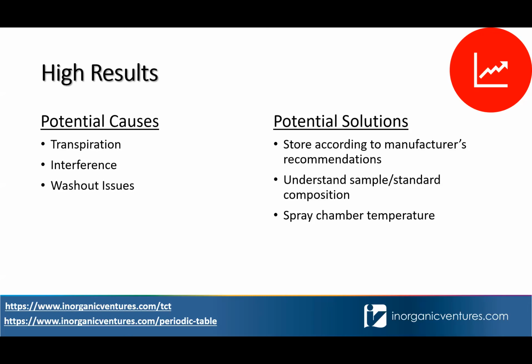For transpiration, we recommend storing according to the manufacturer's recommendations, or the recommendations you would typically see from a manufacturer. We know that refrigeration is not necessary, but there's nothing wrong with storing your solutions at a lower temperature. So just one note of caution when you're handling solutions that come out of the refrigerator is you want to allow that material to come to room temperature and mix that thoroughly before you start using it.